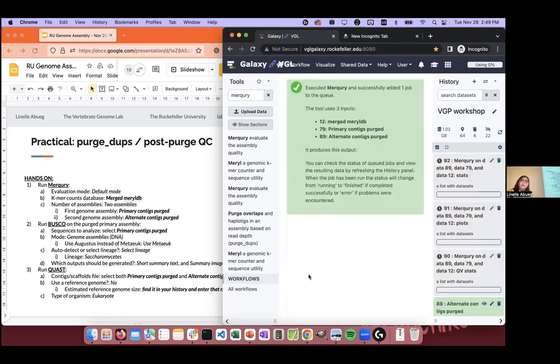Execute mine. So this is just going to help us see if we really did fix it: all those 2-copy k-mers that were in the primary assembly, did we actually get rid of them? And did we actually bring the completeness of the alternate assembly up? Are these actually getting more equivalent with each other, the way we want them to be?